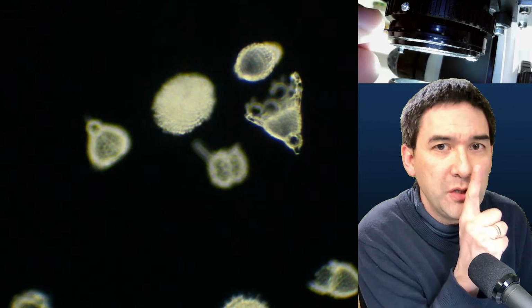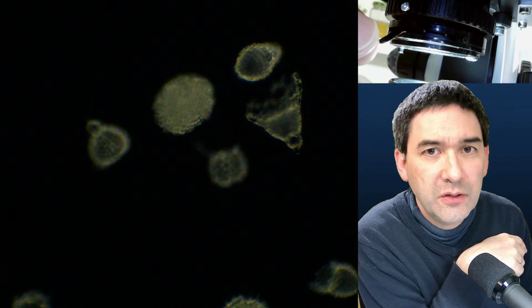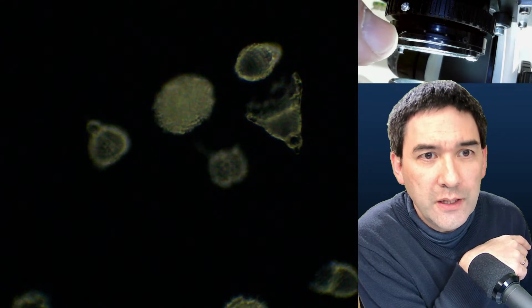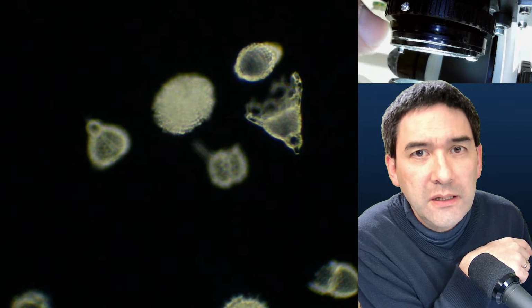So look also up there again. This is the lever, that's the condenser, and look, when I close the condenser, of course everything becomes much darker.